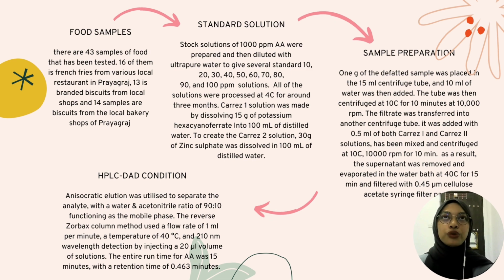The next is the standard solution. The stock solution of 1000 ppm acrylamide was prepared and then diluted with ultra pure water to give several standard solutions of 10, 20, 30, 40, 50, 60, 70, 80, 90, and 100 ppm. All of the solutions were stored at 4 degrees Celsius for around 3 months.